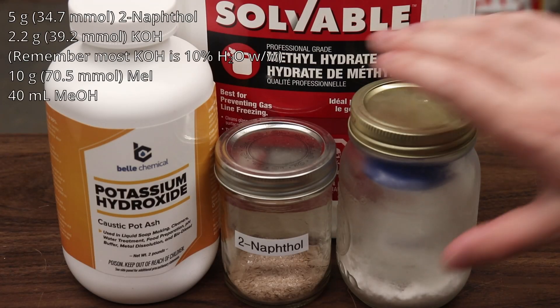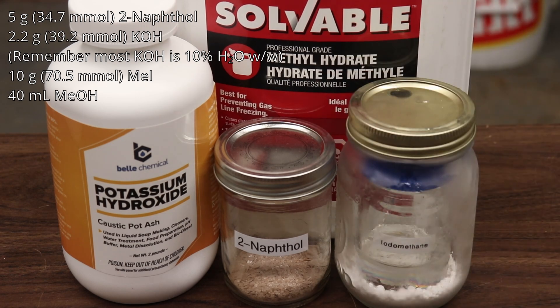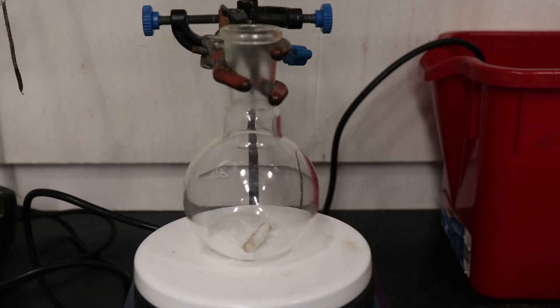While I like the dimethyl sulfate alkylation for its speed, simplicity, and high yield, dimethyl sulfate is quite an expensive reagent and is also extremely toxic. So now I'm going to show how to make 2-methoxynaphthalene with methyl iodide, which is much less toxic, albeit still fairly toxic, and it is quite a bit more accessible than dimethyl sulfate.